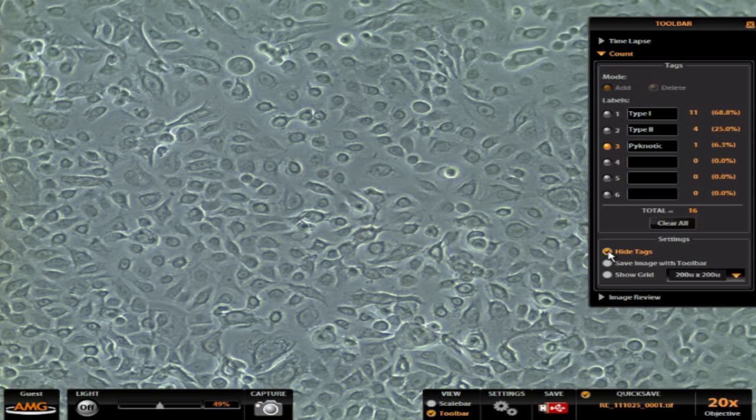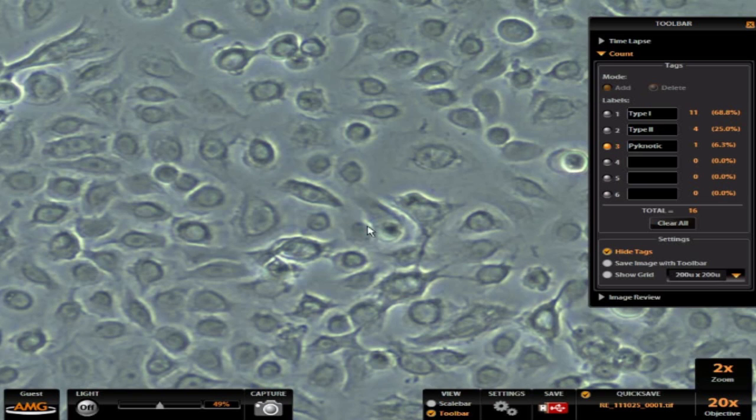I can just click this button here that says hide tags and now double clicking is going to zoom an area. And then I turn the tags back on and I can see them and continue counting my different cell types here, my type 1 cells.